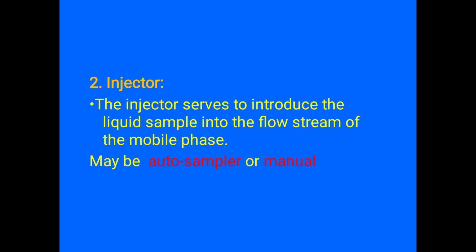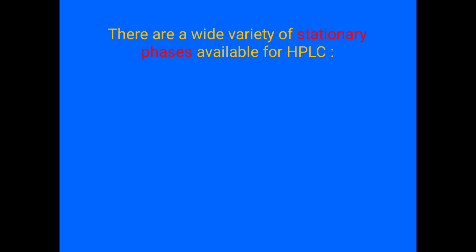Role of the injector. The injector serves to introduce the liquid sample into the flow stream of the mobile phase. May be auto sampler or manual. There is a wide variety of stationary phases available for HPLC.